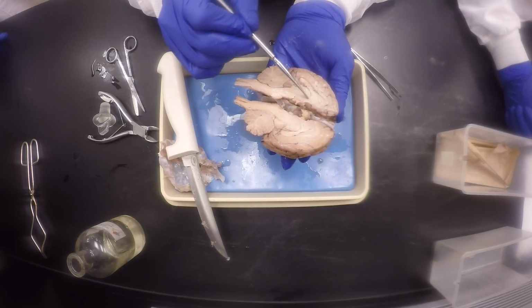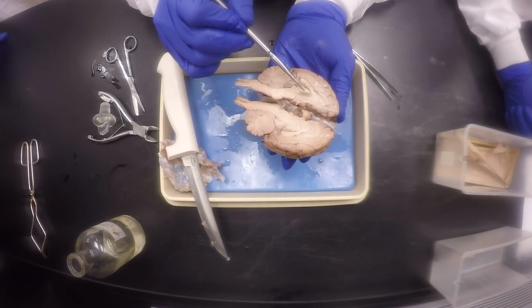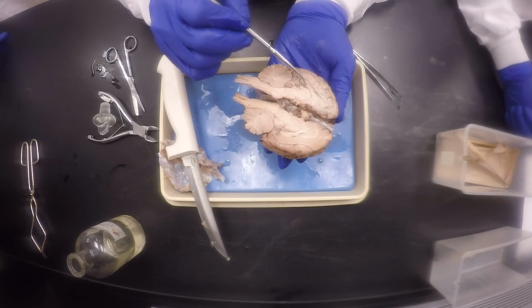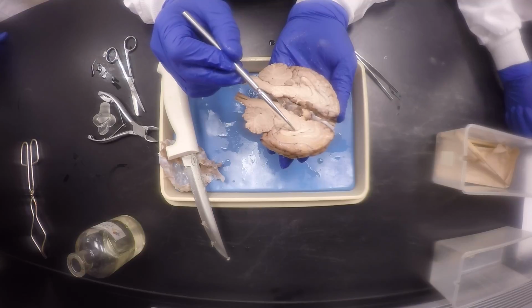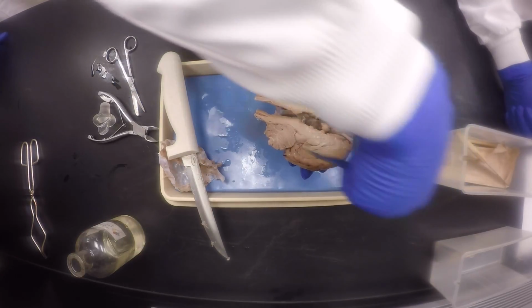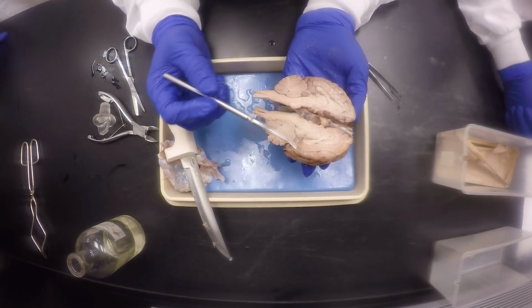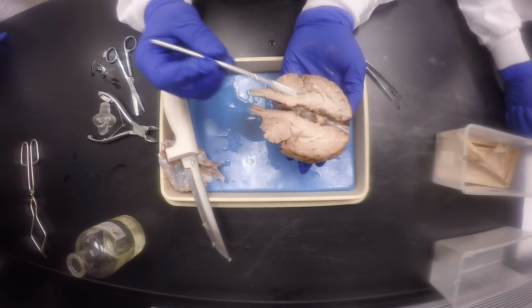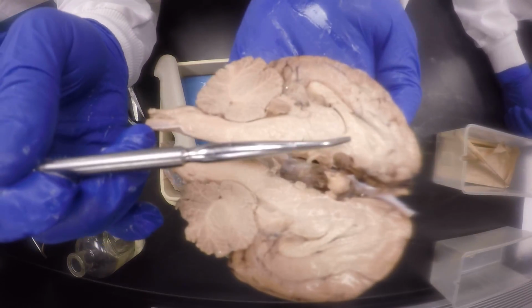Okay, you see this? You'll be able to see it. Oh, I almost cut twice. See, I did a bad thing. I went twice. That's okay. I'm sorry. The only thing is to go one motion like that. I got messed up. So that's the thalamus right there. Okay, you see this little dot right here?